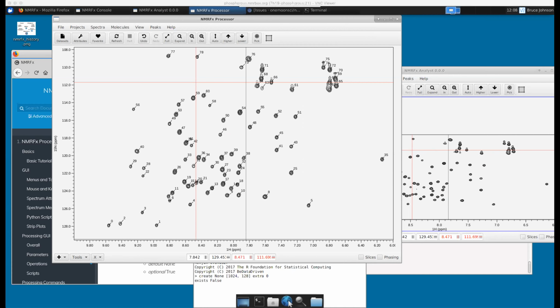So I see a hand raised. Hey, Bruce. Yeah. So are you going to discuss the kinetics fitting today? Will you have time for that? I will show you some. So we're going to do some relaxation T1, T2 measurements. If that's what you're talking about, I'd hope to do a quick overview of titration curves. Titration curve, sorry, that's what I meant. So let's do that as the very first thing when I come back, just to show you that. And then we'll see where we get.